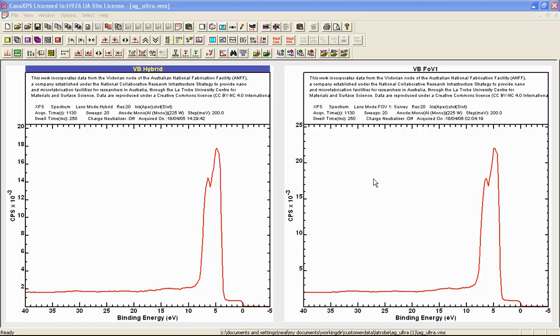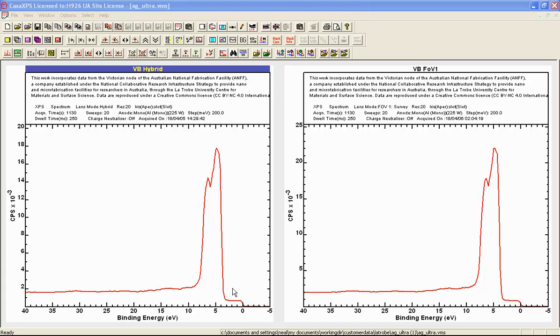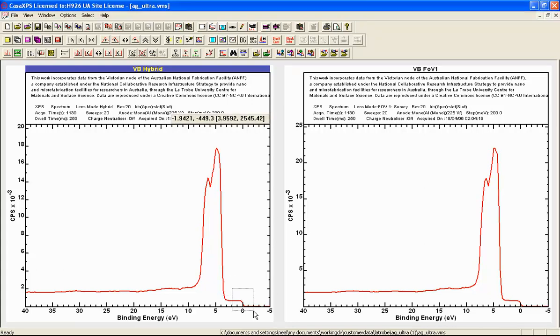These two spectra were measured on the same instrument. The difference between these spectra is that one was measured using hybrid mode while the other was using field view. Both are measured using the same operating conditions for the hemispherical analyzer, namely a pass energy of 20. What we would like to do is do a comparison of these lens modes in terms of energy resolution.